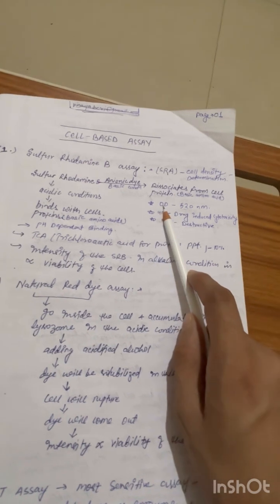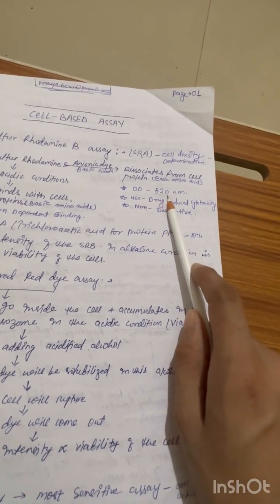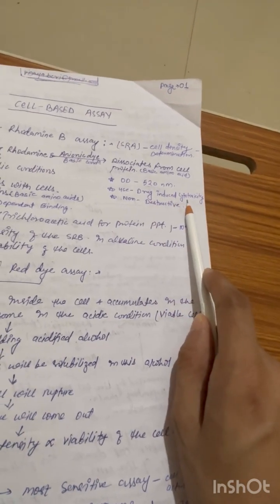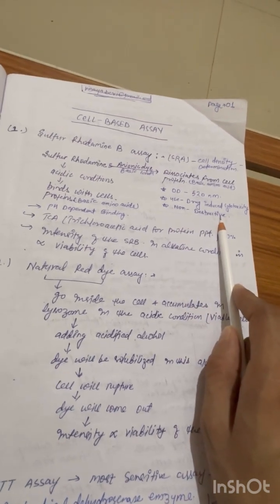In this assay we see the absorption at 520 nanometers, and it is used for drug-induced cytotoxicity studies, and it is also a non-destructive kind of assay.